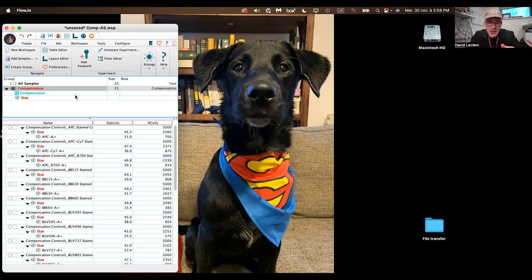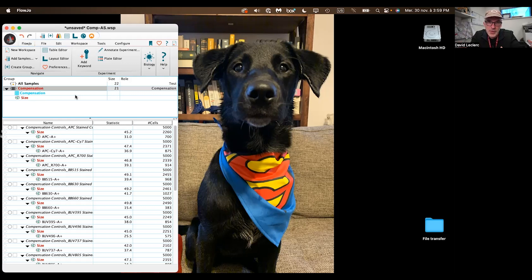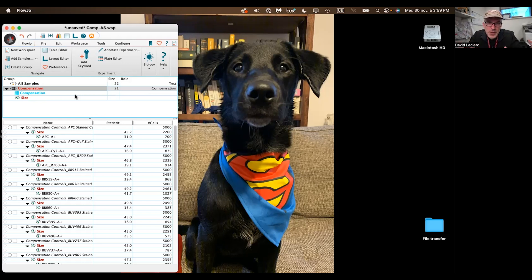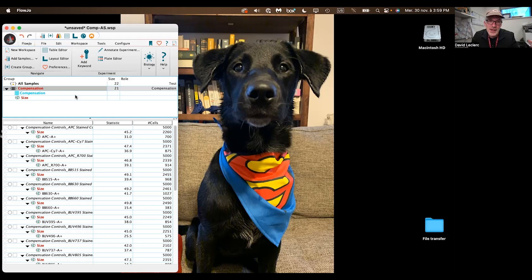Furthermore, after it's done one round of that linear regression, it's going to continue doing iterations of the linear regression in order to reduce the compensation errors that you might have. At the end of the day, you have better compensation.